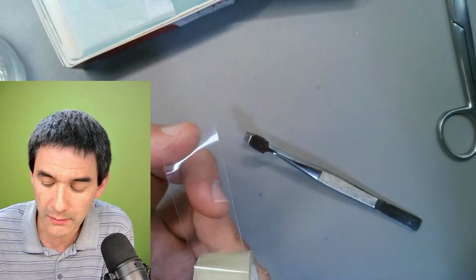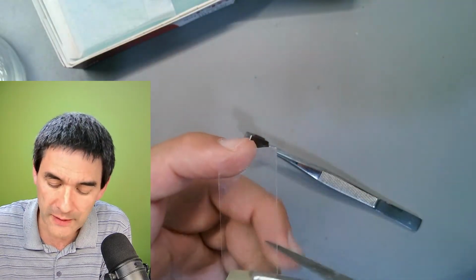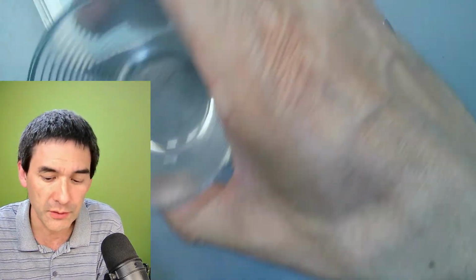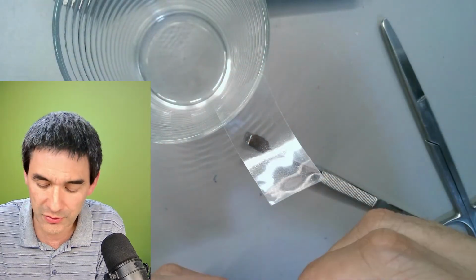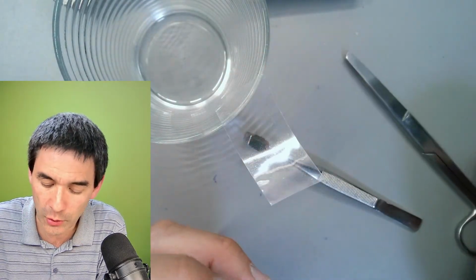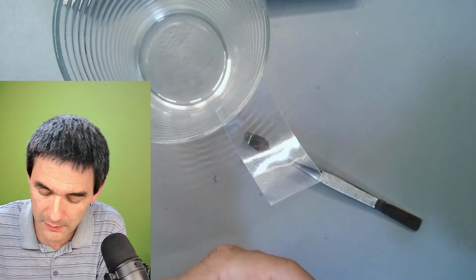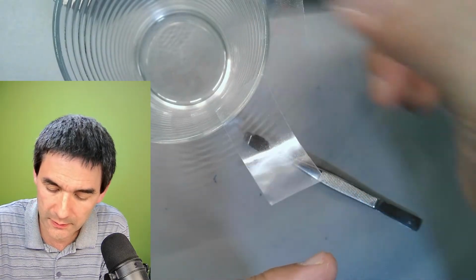If you're lucky. Yeah. So what do you have to do? I prepare a little bit of tape here, a longer piece of tape. Where am I going to put it? I'm just going to put it here now, just for right now on the side here. Okay. To keep it for later, and then I need 2 smaller pieces of tape as well. Okay. 1 and 2.